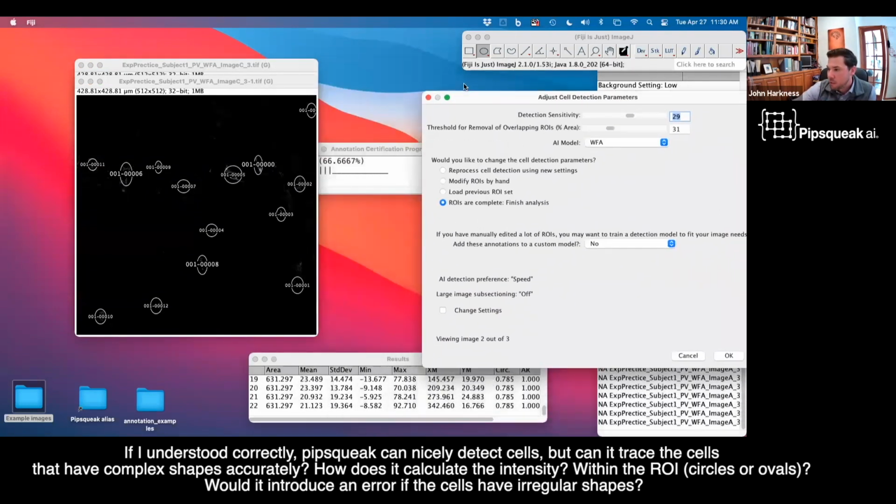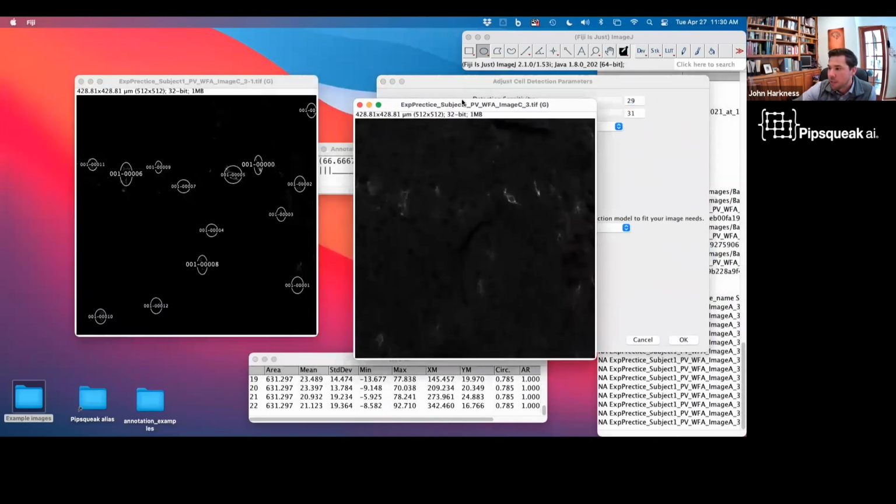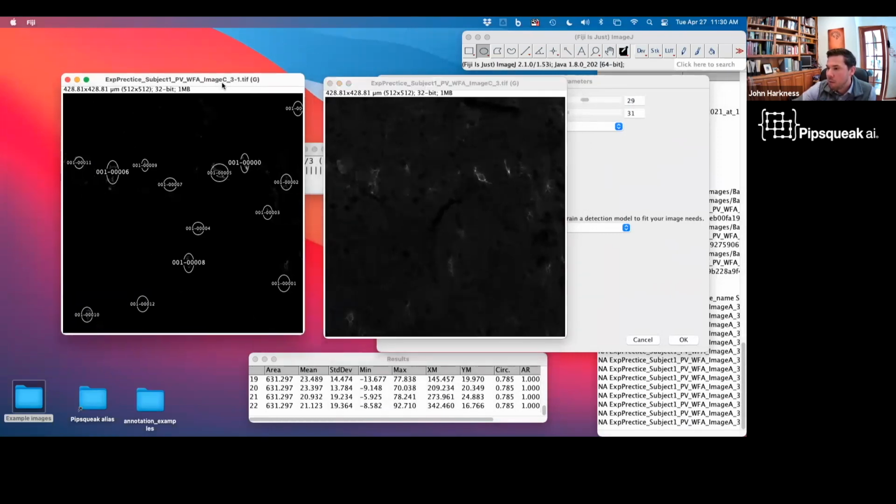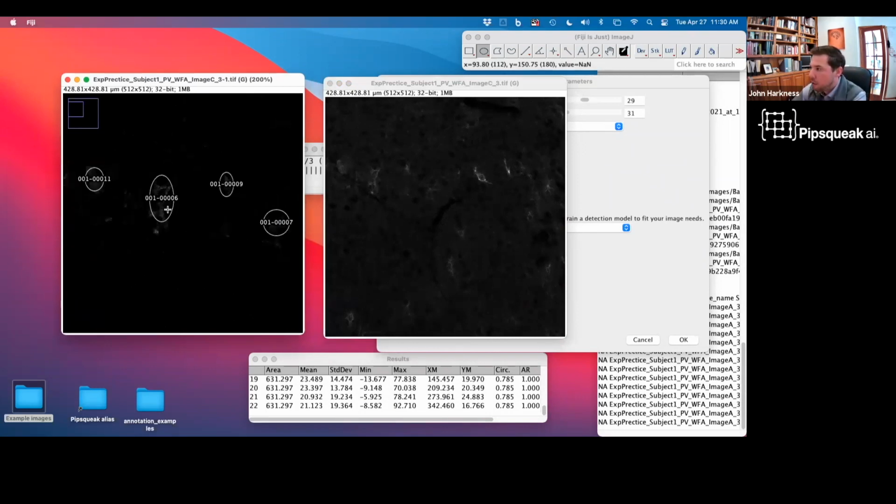we adopted in the Sorg lab when looking at our ROIs is that we subtract out the background, so that the space around a cell in an ROI is typically set to a NaN value. If you look at my cursor going around this cell, and then you watch up here in my ImageJ browser, you can see that a lot of the pixels around that cell are actually set to NaN. And NaN just means not a number. That means that they've been subtracted out, and what that does is it removes those pixels from the intensity calculation. They don't contribute to the mean.